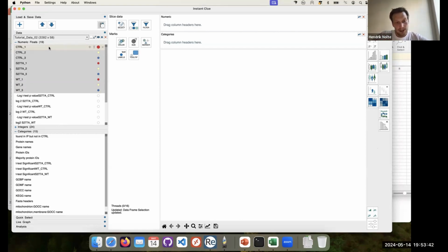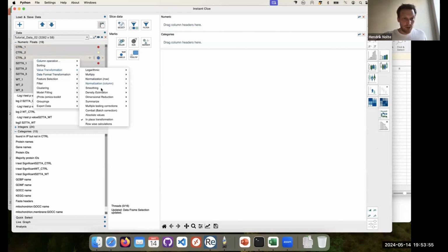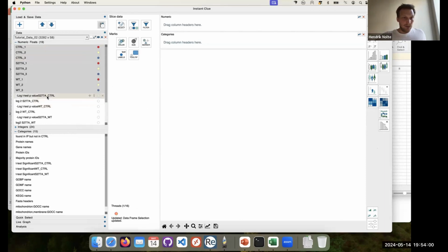Therefore, I highly encourage you to go to the GitHub pages, where there is this link to play around with UMAP and understand it a bit better. And I will just show you how you can do that. Again, you can just go here and click on UMAP.